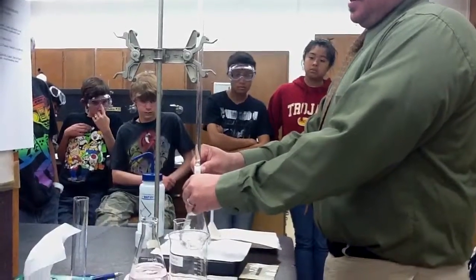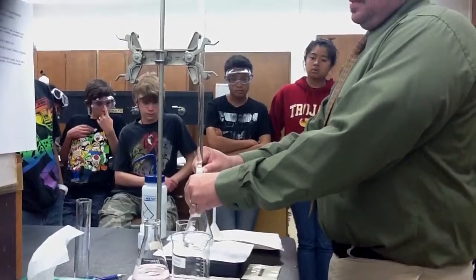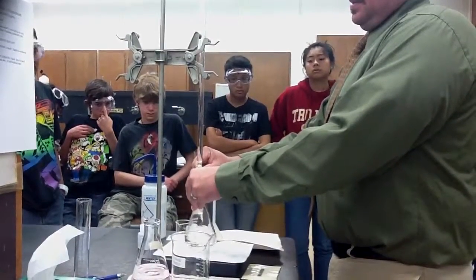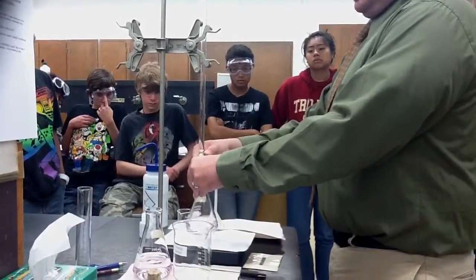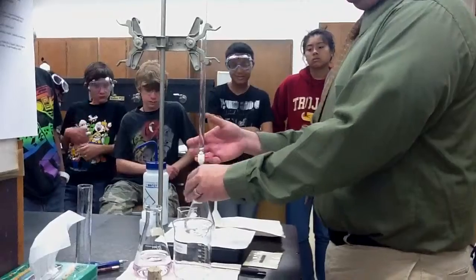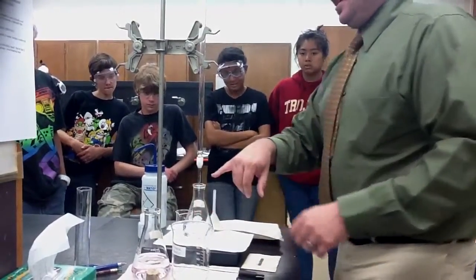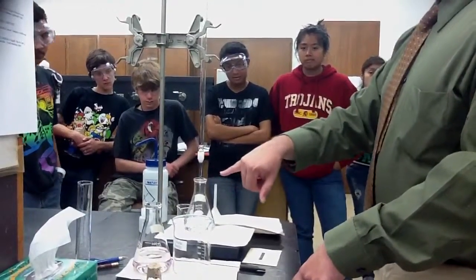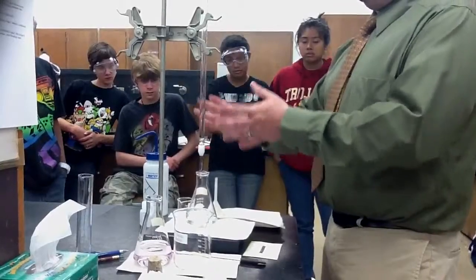After we back off and you add a couple drops, mix it up. So like I said, if you get really, really good at it, it's almost there. See, now it's taking longer, right? So I know I must be there. Right now, there's a little drop hanging right down below. For that, I want to make sure I collect it, because that's already been taken into account with the volume.